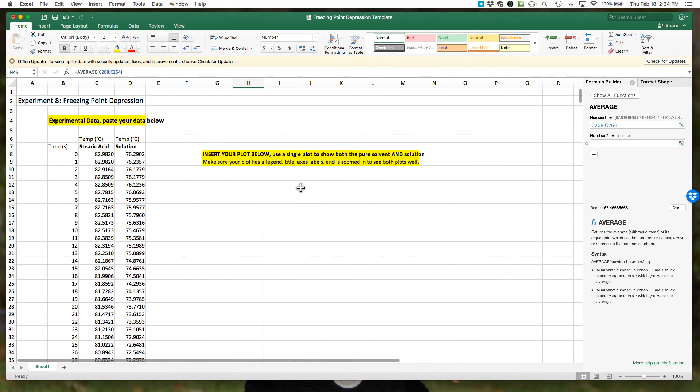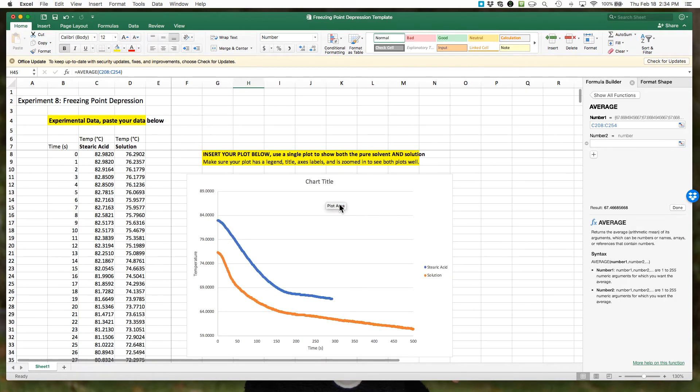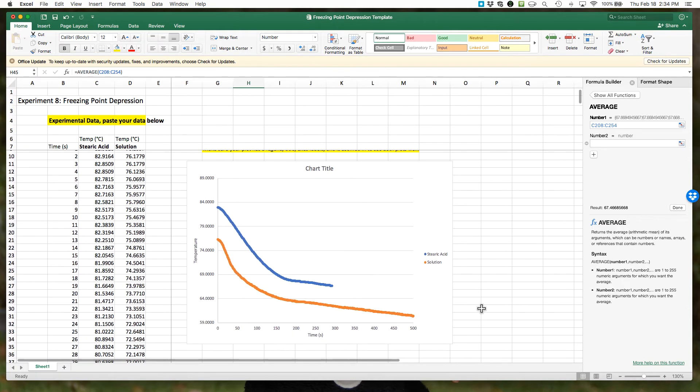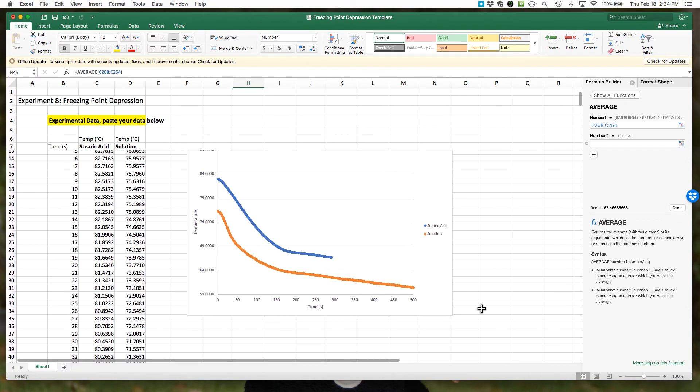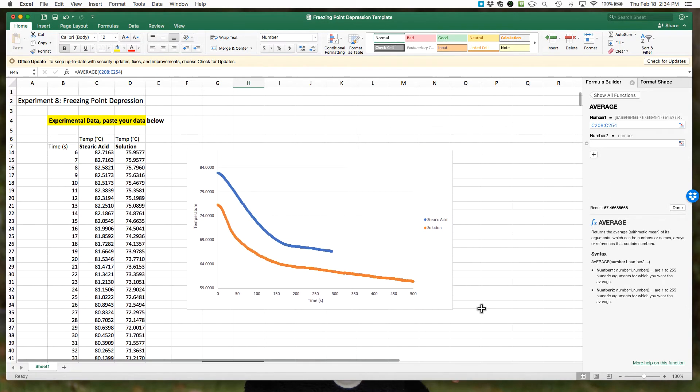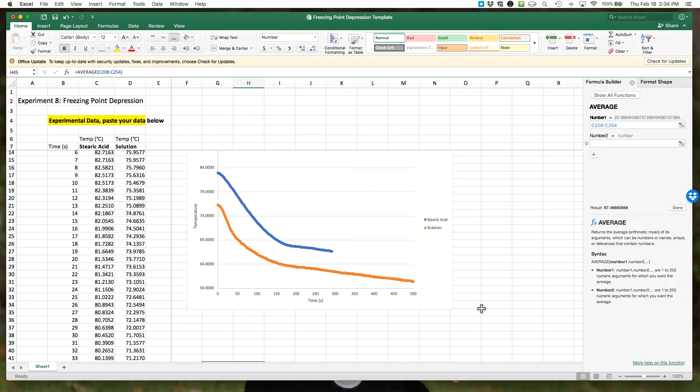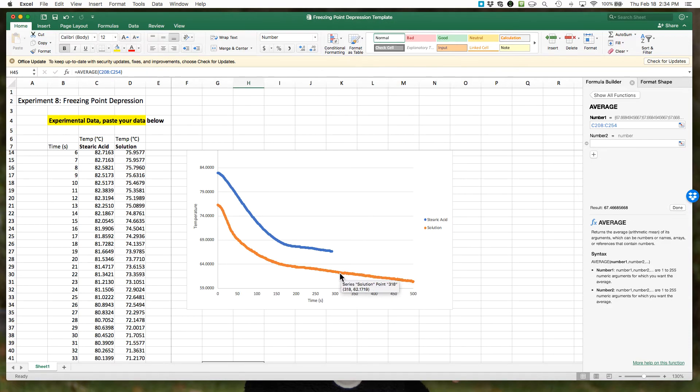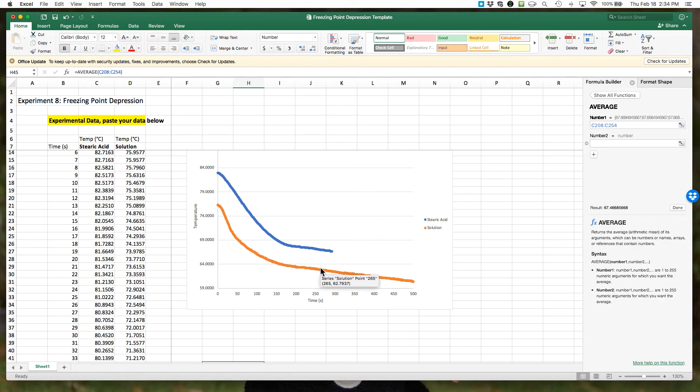For our solution, we're going to do the same thing, but what we have to do now is find where is that plateau. Again, the tricky thing is what we see in these curves is there's a plateau, but if you collect data past the plateau, your solution will start to cool down more as the solid starts to freeze. You can think about where is the plateau in this. I might say the flattest part is actually here, and then it starts to cool again.